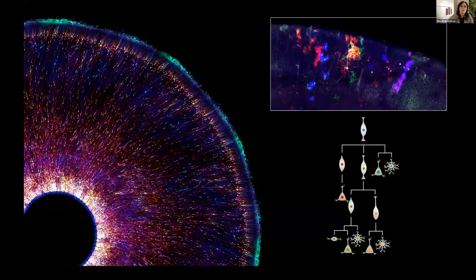And so the last thing that I wanted to tell you about this image is that it actually started with my advisor encouraging me to just give these color barcodes a try and see if they would work for lineage tracing. Worst case, he said, all you get out of it is a pretty picture. And I think that so far that's worked out pretty well.